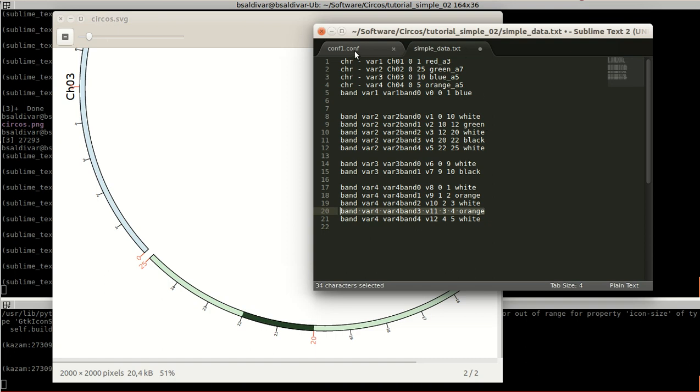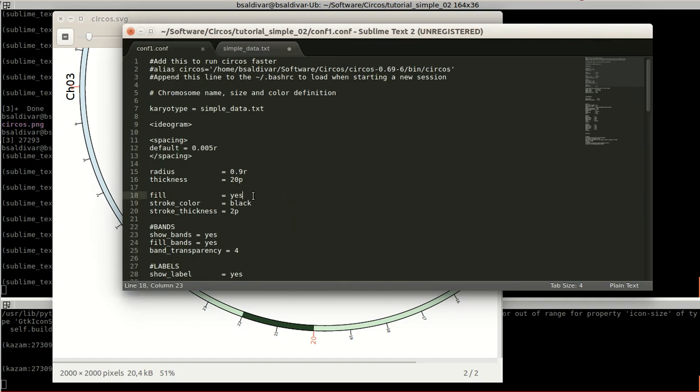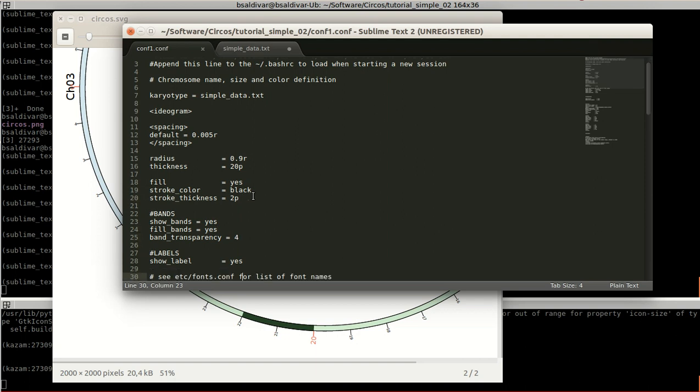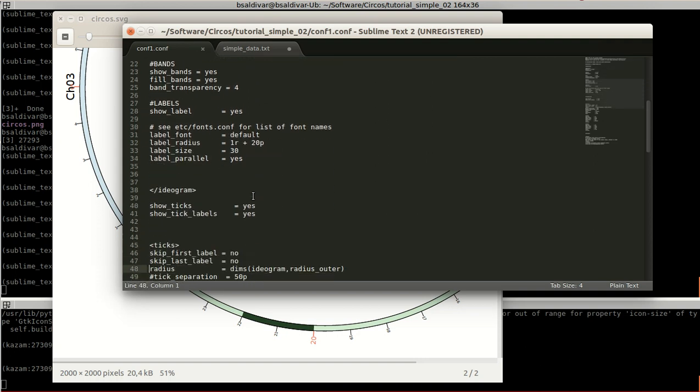In the configuration file, over here, we have a lot of options. First, this part of bands has to be specified. And here, show bands you have to set to yes, fill bands to show the color of the bands, and the band transparency to overlap the color that is behind in the color of the karyotypes.